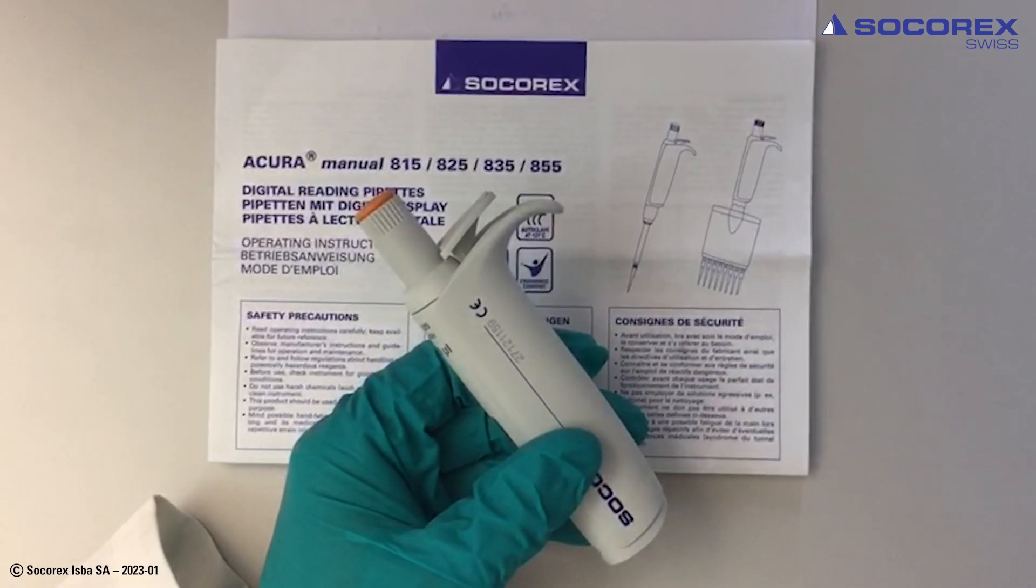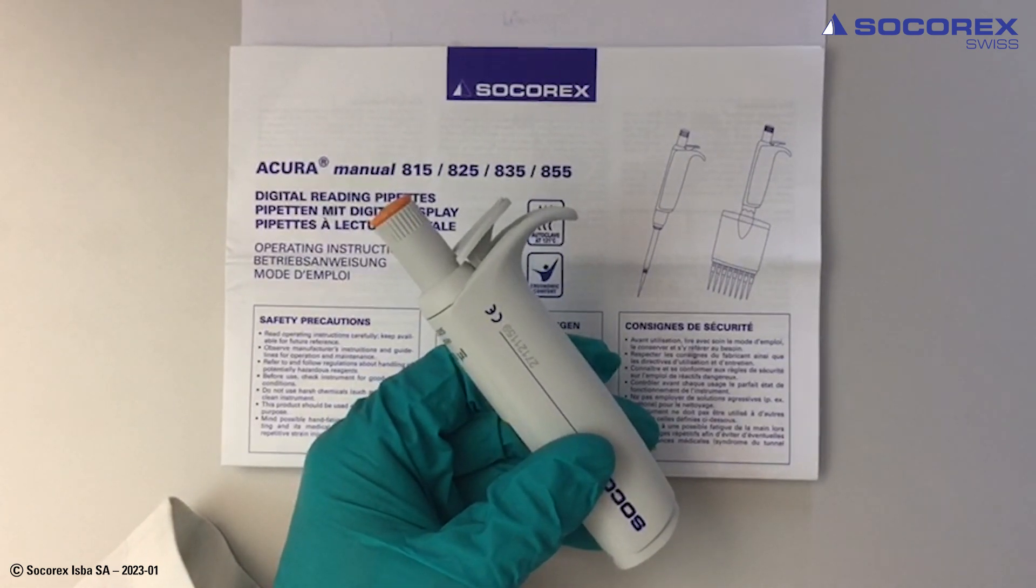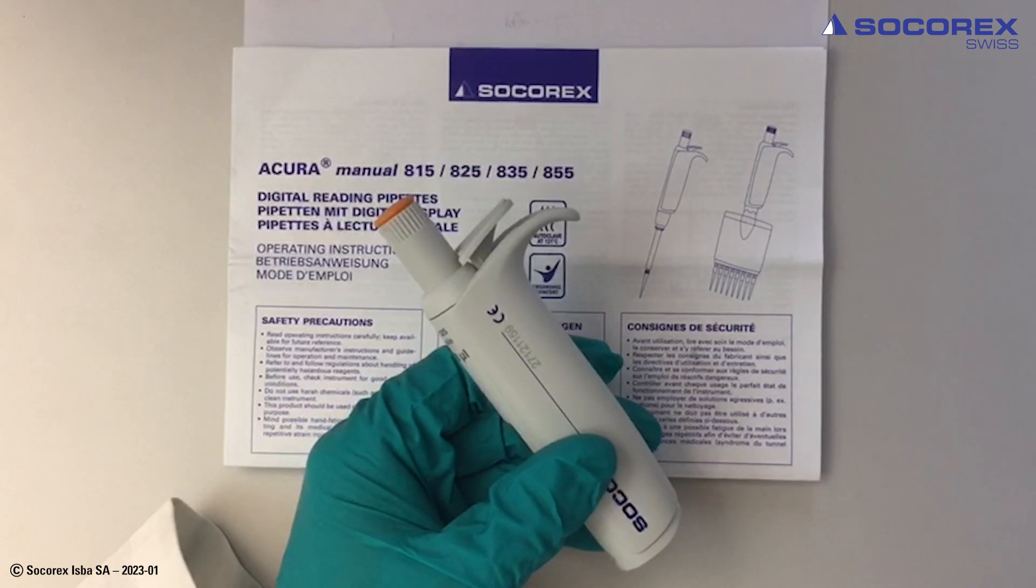Acura manual, valid for all Acura manual pipettes. This shows the removal of the internal tip ejector and counter assembly.